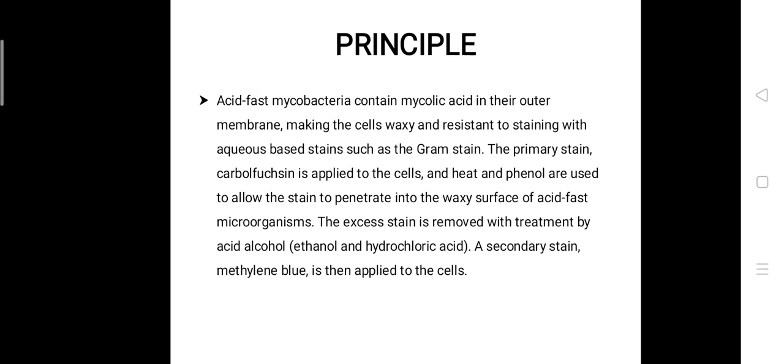The excess stain is removed with treatment by acid alcohol, ethanol and hydrochloric acid. A secondary stain, methylene blue, is then applied to the cells.